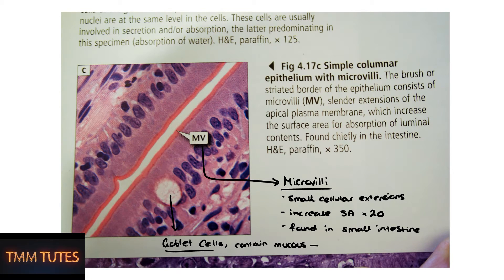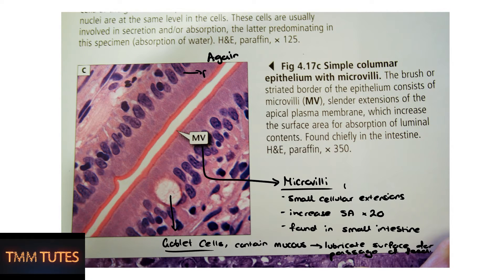We also have a goblet cell there, filled with mucus, which is secreted into the lumen to lubricate the contents for food passage. Goblet cells are also very important in respiratory epithelium. You can see the H&E stain — the nuclei are slightly more purple, but definitely not as dark as the nucleus itself.